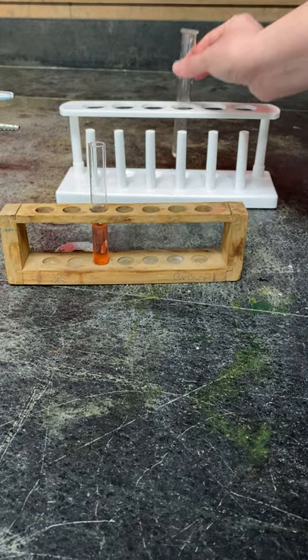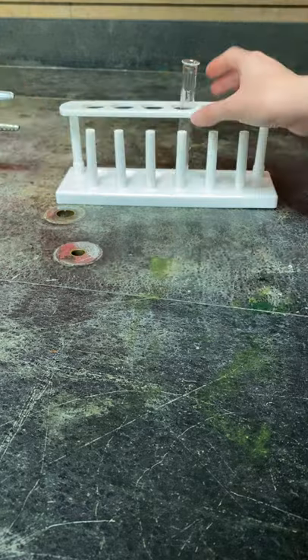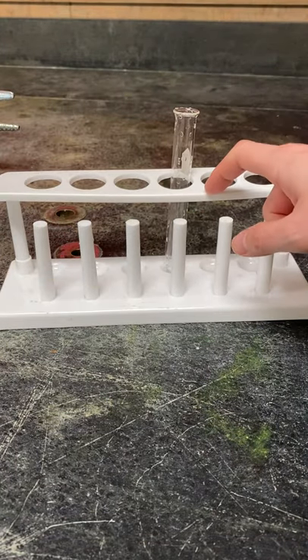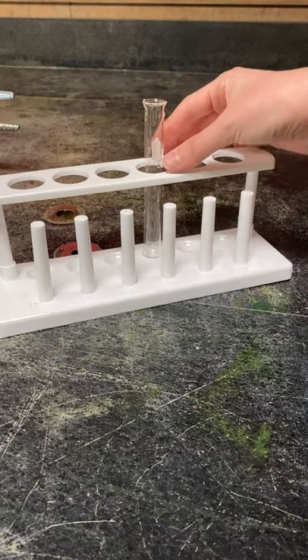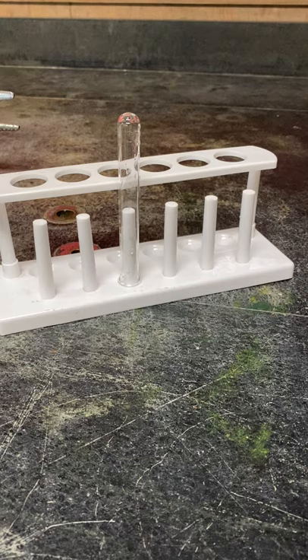Some test tube racks have a feature like this white one here where you can use them to dry. So once you're done with your experiment and you clean up all your equipment, you can put your test tube on the rod and let it dry overnight.